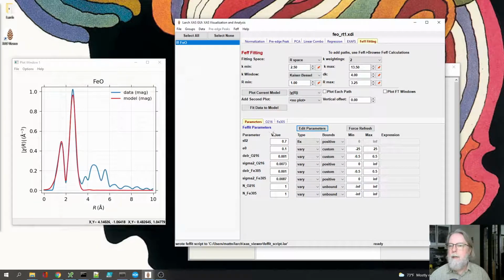Let's go back here. So now we have the variables that we're going to use, and I should make sure that that's 6 and that's 12 as the starting values. Again, it's not super important that those starting values are super close to the right values, but they should be close. Now, I can also assert that the coordination numbers should be positive. I can even assert that they're positive and less than 100. That would be a fine thing to do.